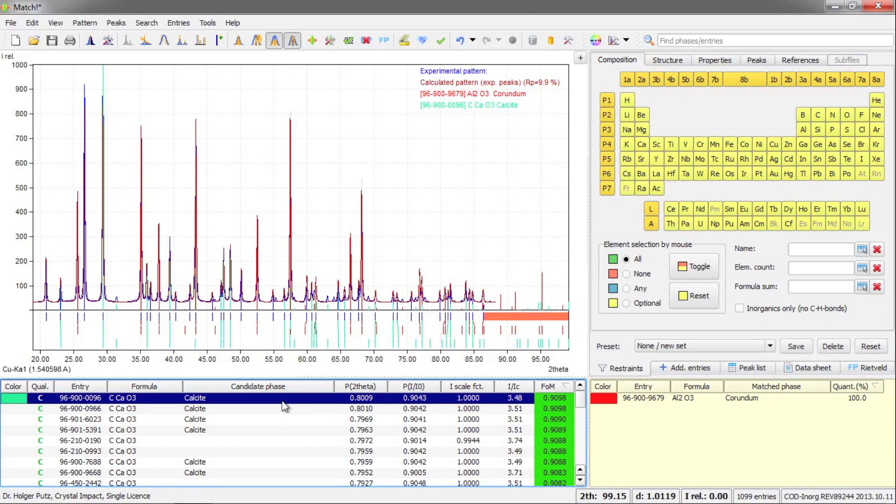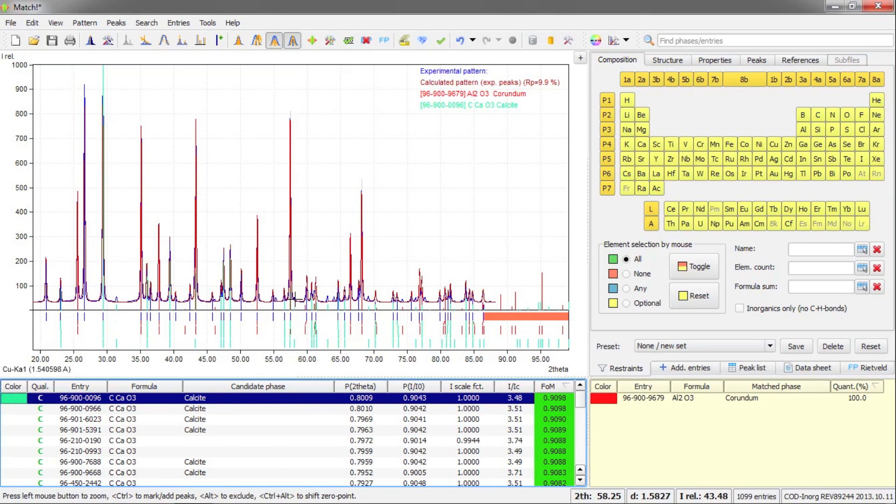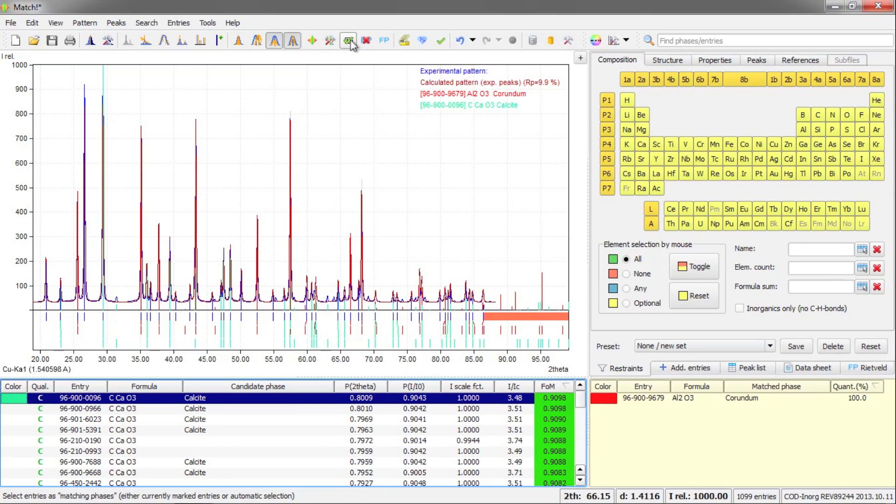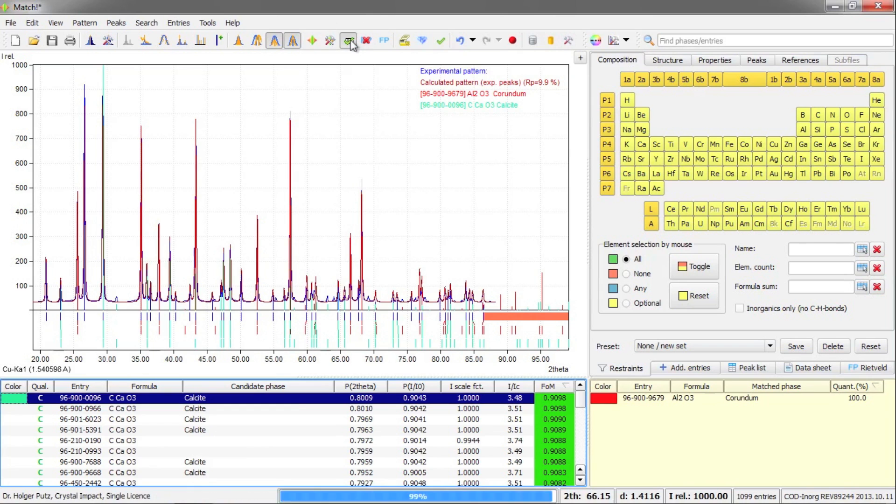The match list now contains the phase corundum. The program now automatically suggests the next best matching phase, which is calcite. And also in this case, the agreement is pretty good. So I again press this button here in the toolbar and accept this phase as matching.